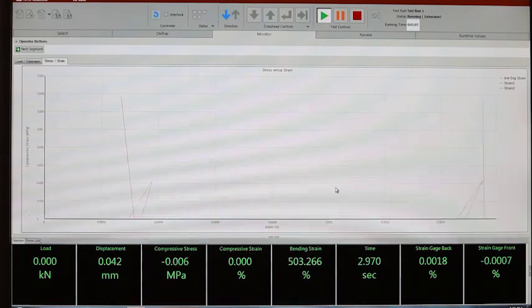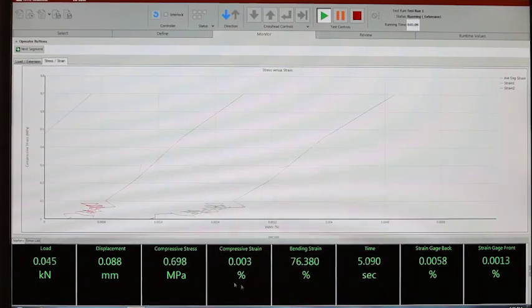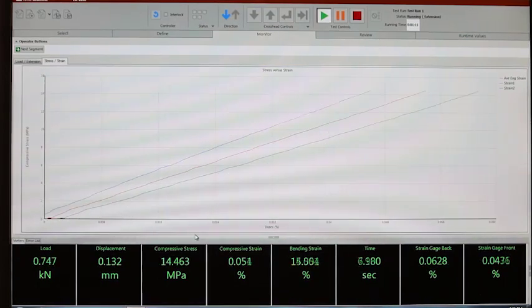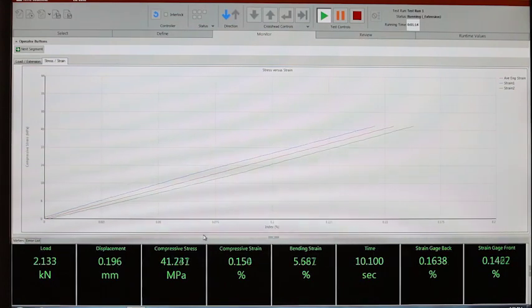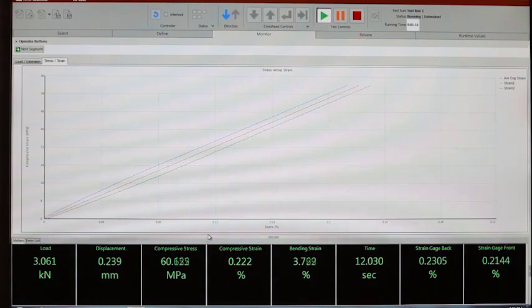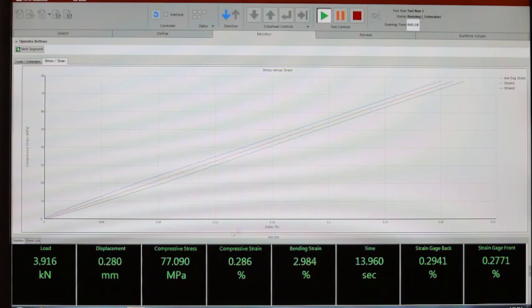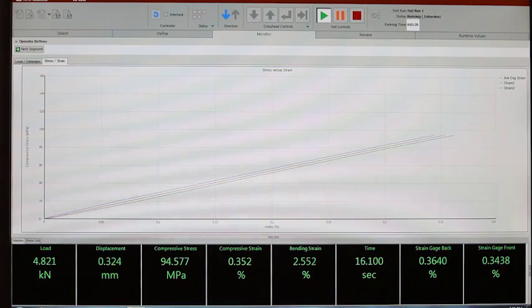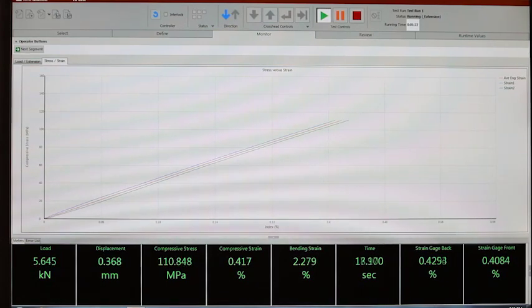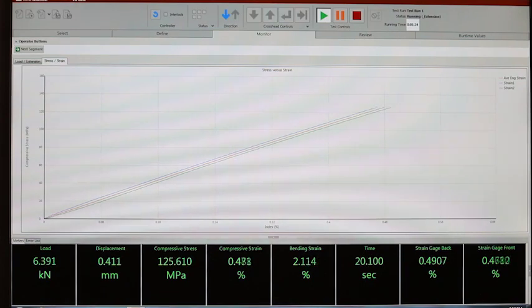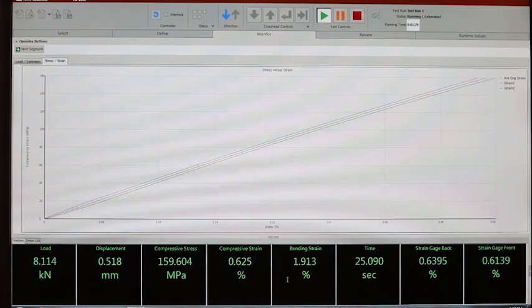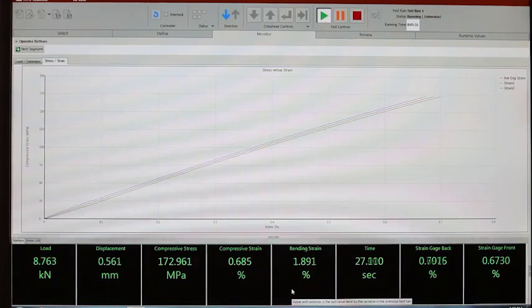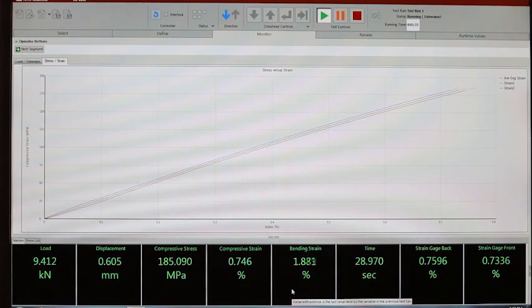Now the specimen gets loaded and initially with small strains we don't see large values, but as we can see, the load is increasing. The strain front and back, as well as the compressive average strain and the bending strain, are calculated. The bending strain should stay throughout the test below 10% to be a valid test.